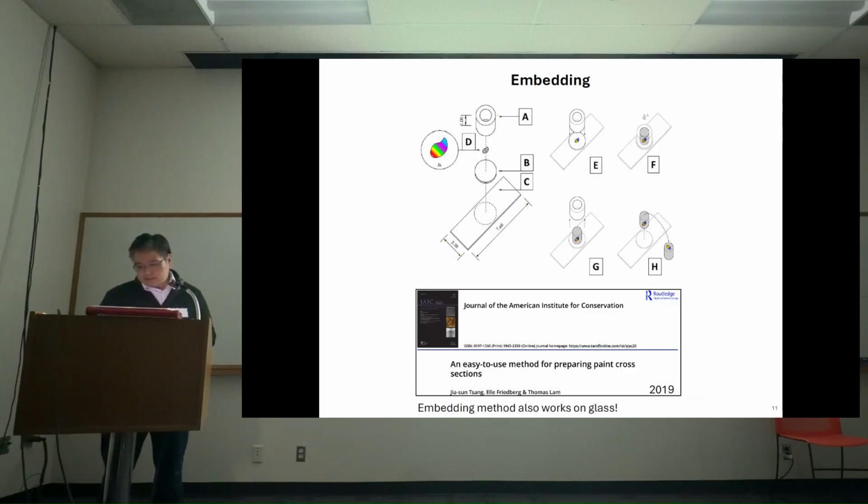It takes advantage of products you buy from Supermarket, called restickable dots. You stick the dot down with the paint cross section, use either a bioplastic or resin, and form a mount. The stickable dot doesn't wet with the epoxy, and you can peel it right off, so nothing is submerged. Your polishing becomes a lot easier.